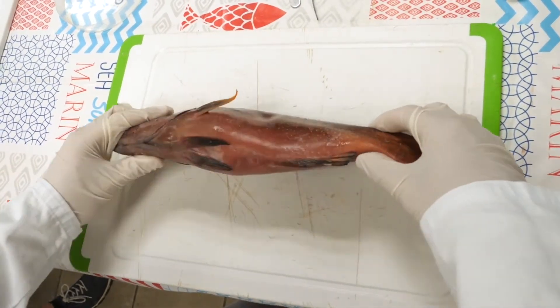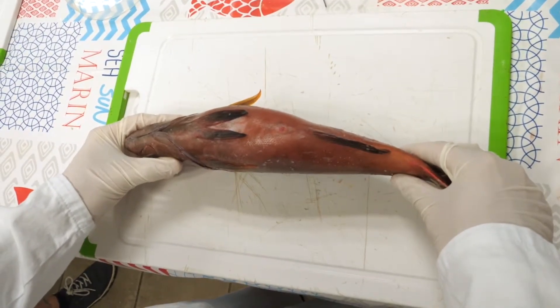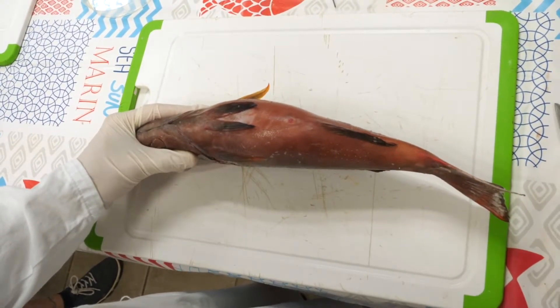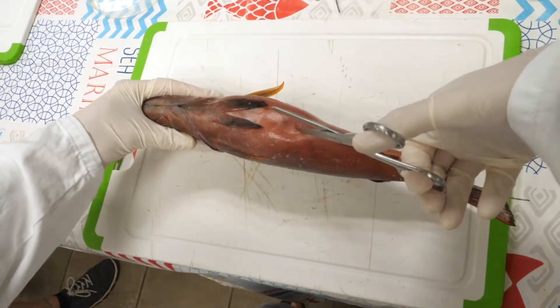To begin, turn the fish so that the abdominal cavity is facing upwards, like this. Next, make an incision from the anus to the gills, making sure not to cut beneath the skin to avoid damaging the internal cavity organs.